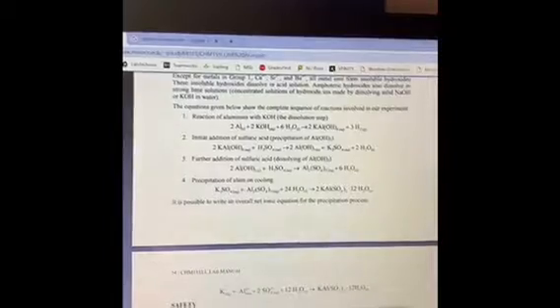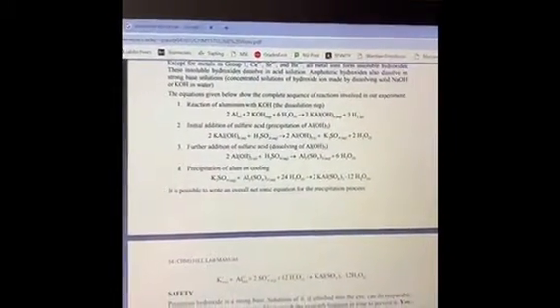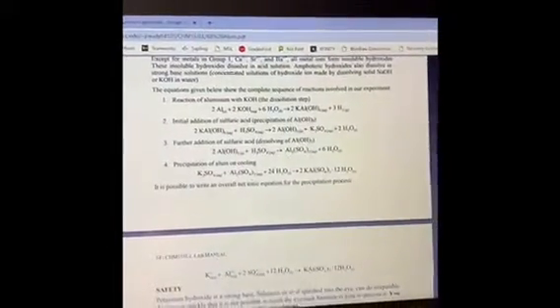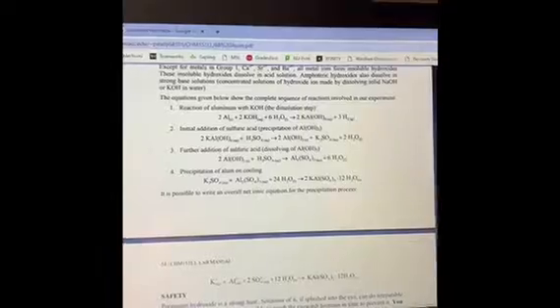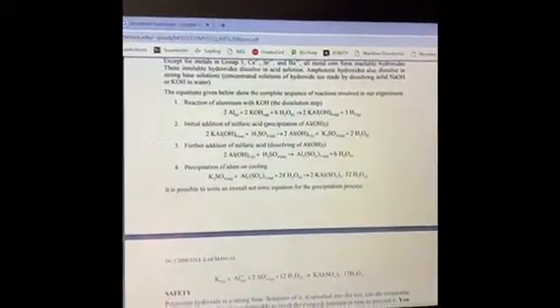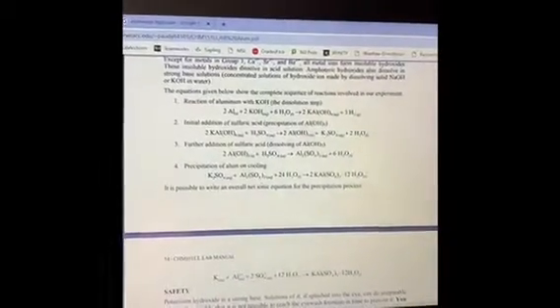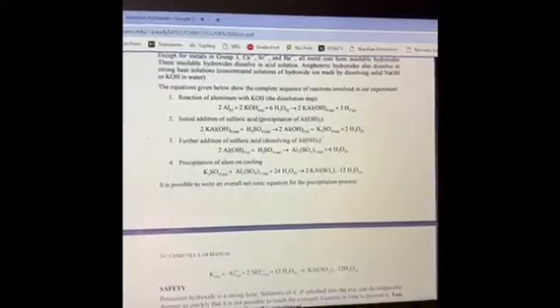And what we do next is we cool the solution to make it completely saturated very quickly, and a large amount of the alum precipitates out in the form of fine white crystals, which is represented here. From there, we take those crystals, we rinse them, get them cleaned up, and then we use those to make a saturated solution.